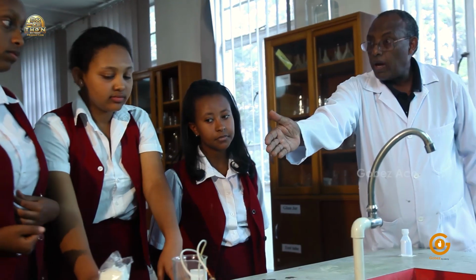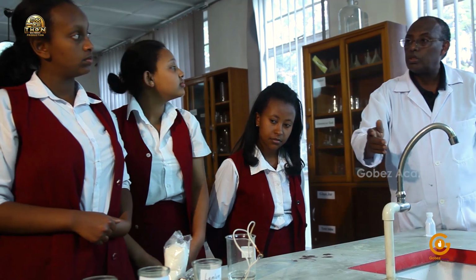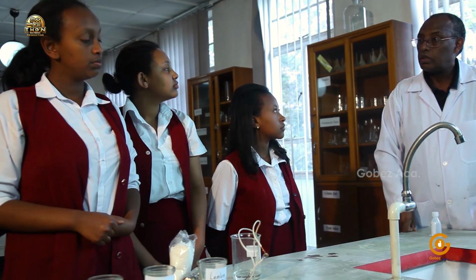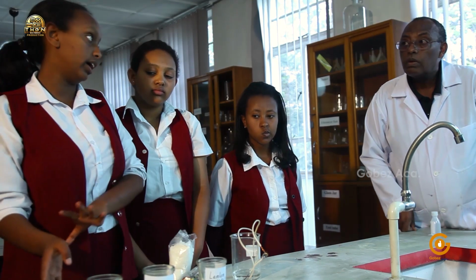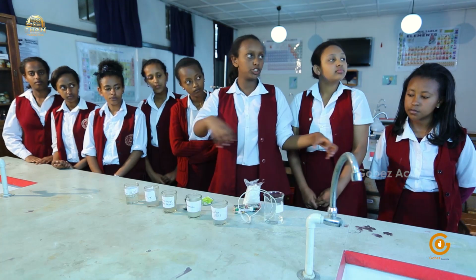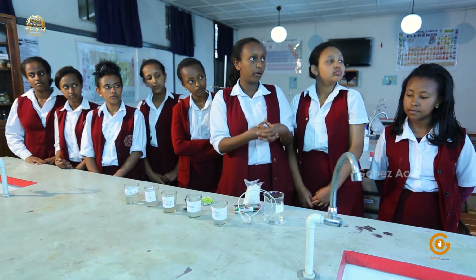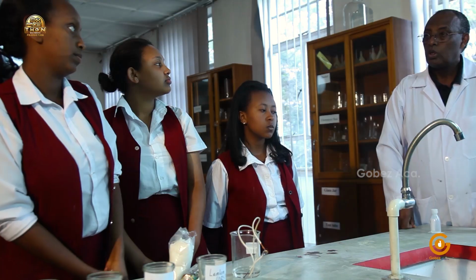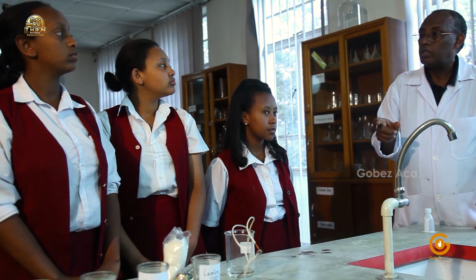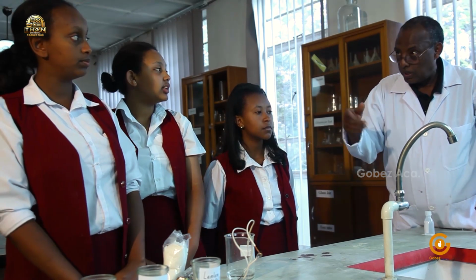Well, we have sodium ions here. We have chloride ions here, as we do in the solution. But we don't see current. Because in the solution we have mobile ions. They're free. They have to move around, so they'll create a networking bridge between the two wires. But here they're not mobile. They're in a compound form, in crystal form. So it is not enough to have ions to see current. You must have ions, but the ions have to be mobile. So they have to be free.